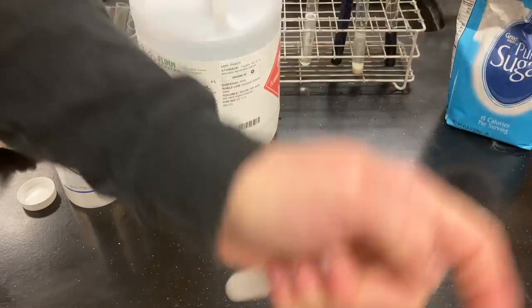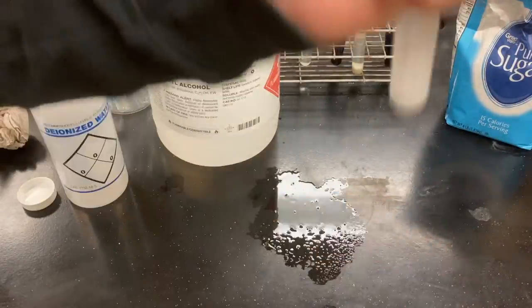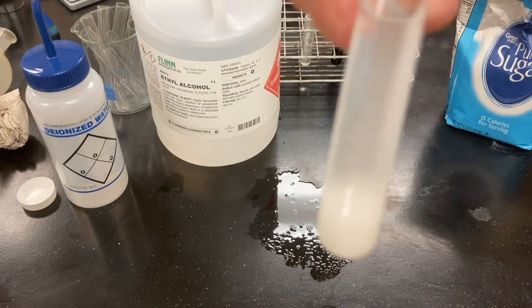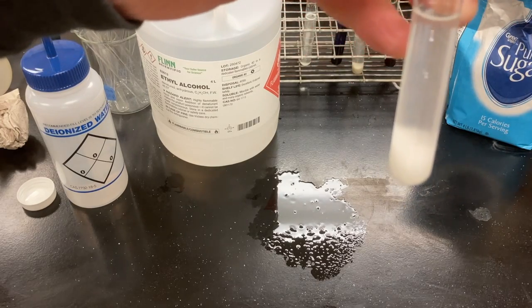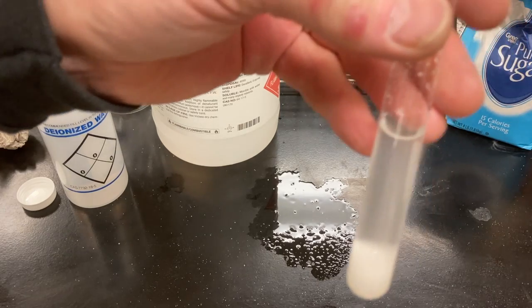Doesn't look like it's mixing. And after quite a bit of shaking, when I take a look at the end, it doesn't look like it dissolved and disappeared into the ethanol like it did in the water. So it depends on the substance being mixed, both of the substances being mixed.